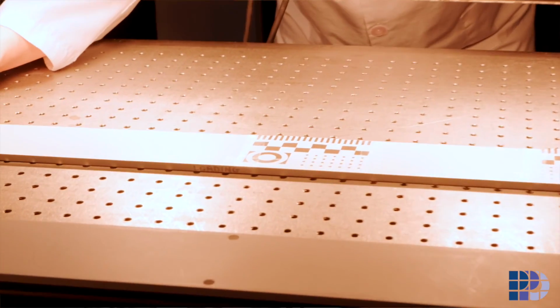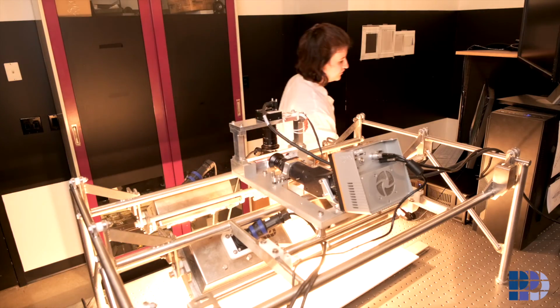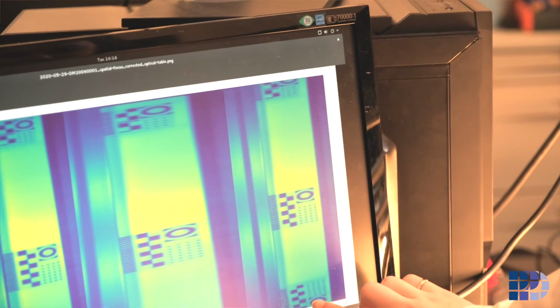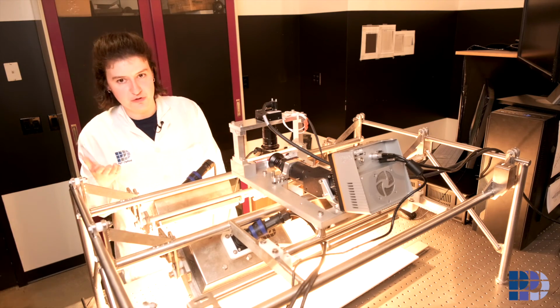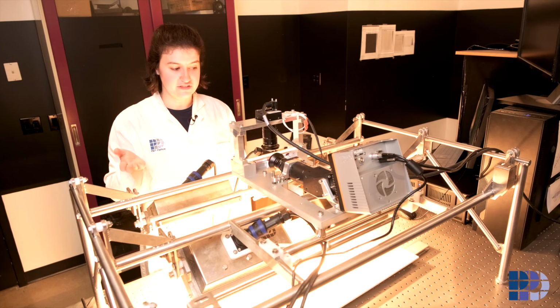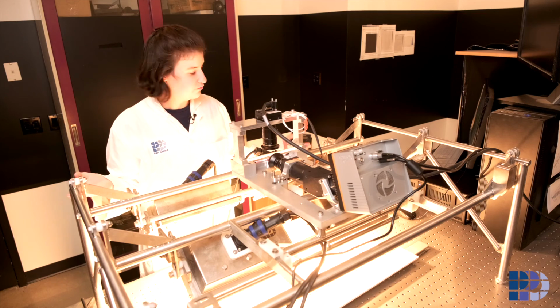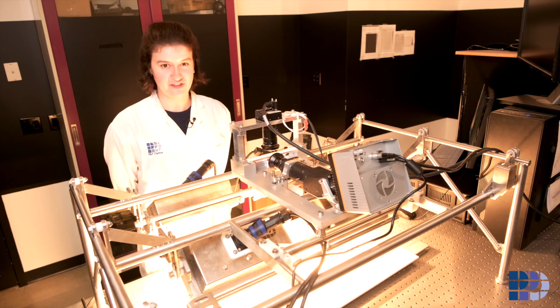So once we've scanned our spatial focus target, we'll take a look at the data to review it. And once we approve it, the spectrometer and vis camera assembly is ready to be put in our waterproof enclosure. And once it's in the waterproof enclosure, we can put our entire frame onto the system itself, and it's ready to go.